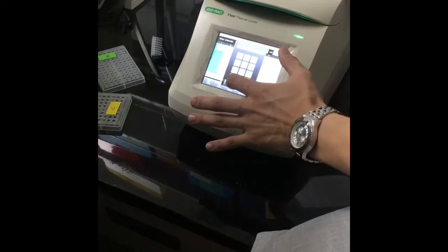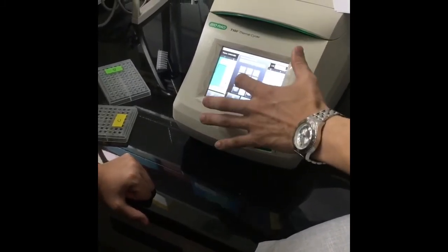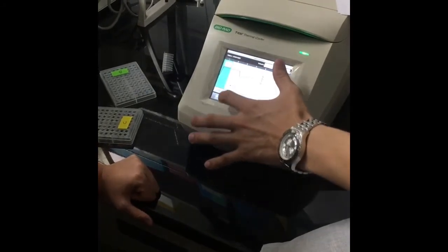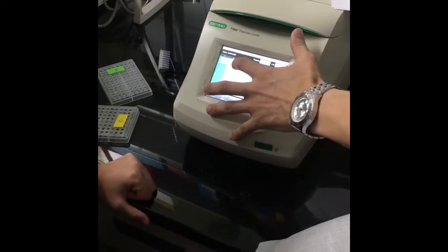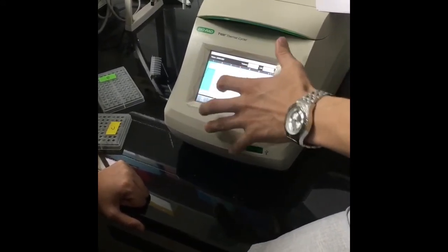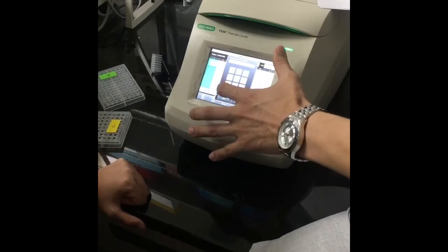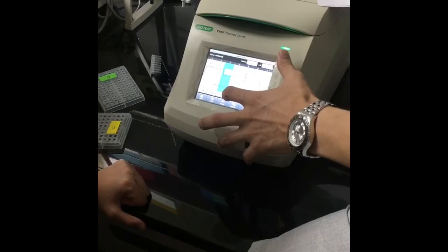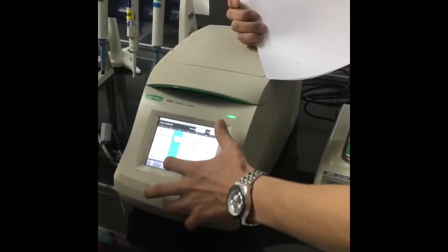If we need to change, just touch it. Then change the numbers, okay? In this case, it's only 25 or 26 seconds, and we need 3 minutes. Then 3, 0, 0, 0, so 3 minutes. Then 95 for 30 seconds. Okay, we need to change this to 60. Yes, 60. Okay, 72 for 45 seconds.